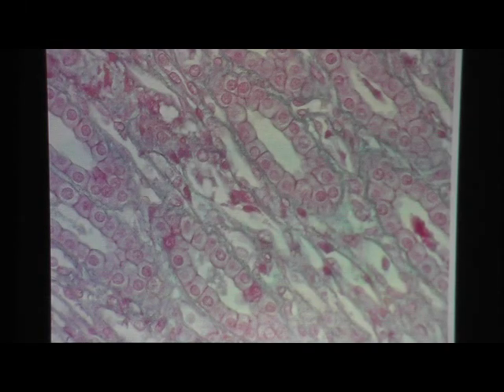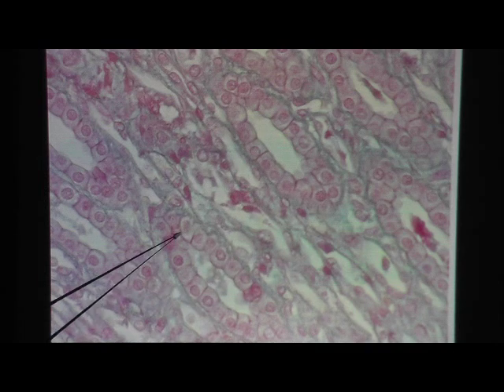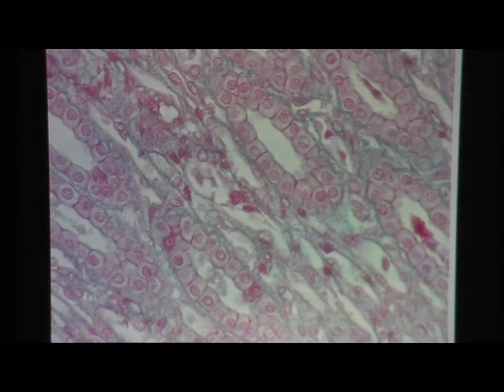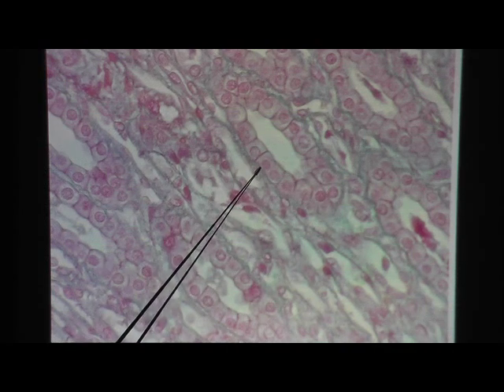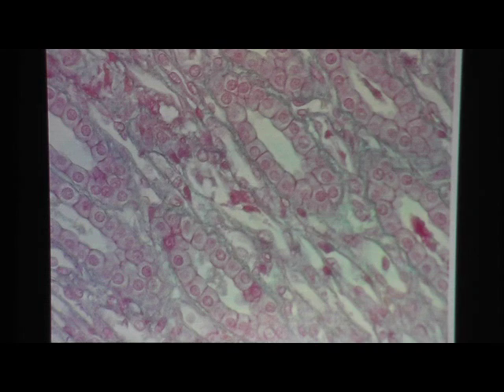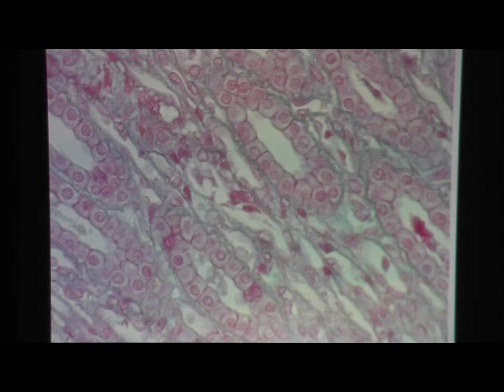Here's another look at simple cuboidal epithelium — each one is a tubule, and you see simple cuboidal cells lining each one. Remember: if the question asks to name this tissue, say simple cuboidal epithelium. If it asks to name this cell, say cuboidal cell. You'll also be asked to name the nucleus, cytoplasm, and cell membrane. For one location, you can say kidney tubules or thyroid.